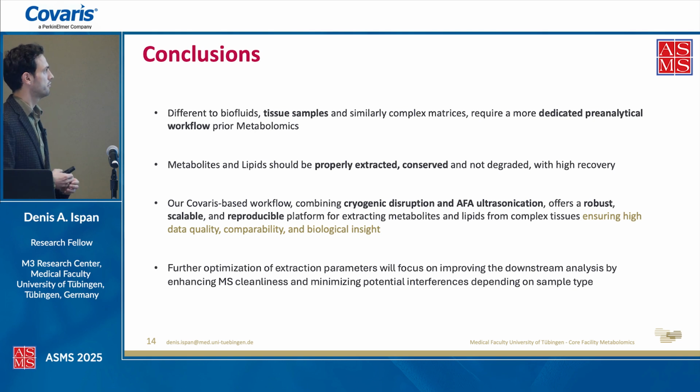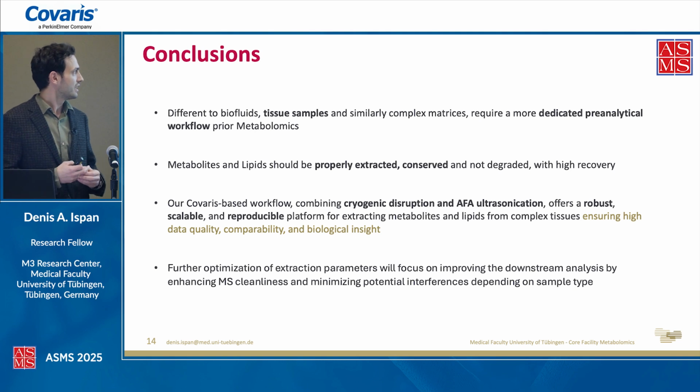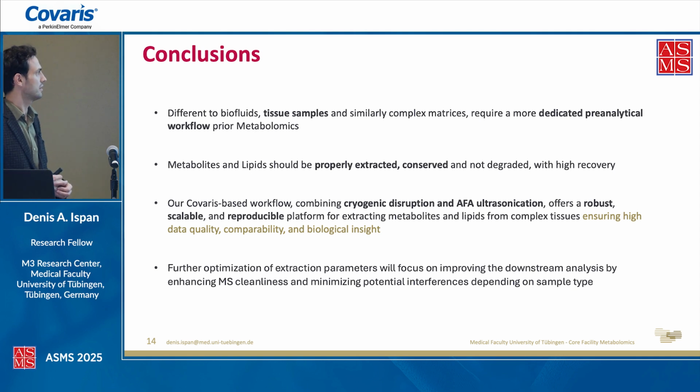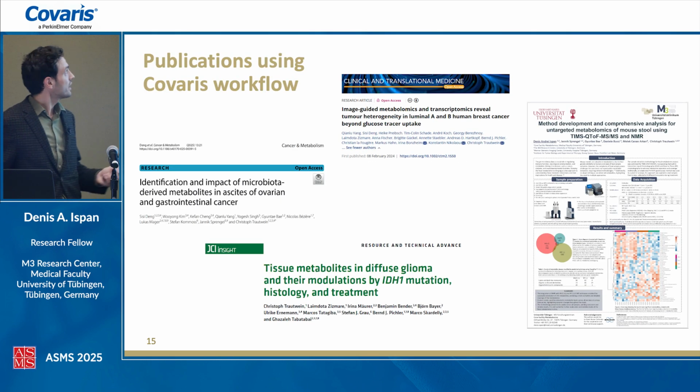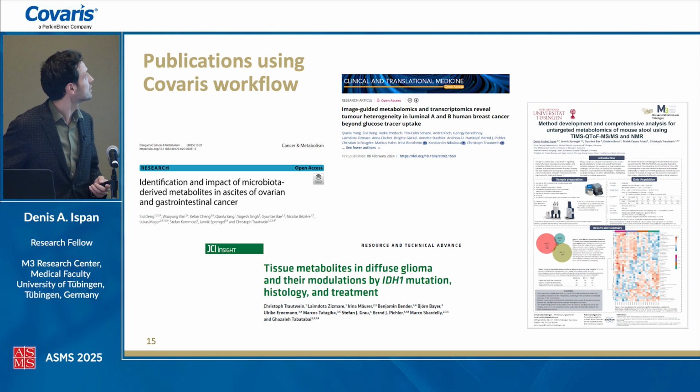And then we are planning further optimization of these extraction parameters that I was showing you, focused on obtaining maybe MS-cleaner samples. So we'll be focused on that in the future, and with Covaris help as well, I think. Here are a few of our publications with the Covaris workflow, and many more on the way with different samples.